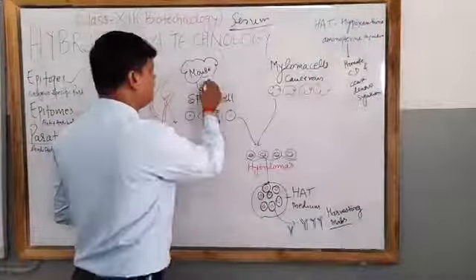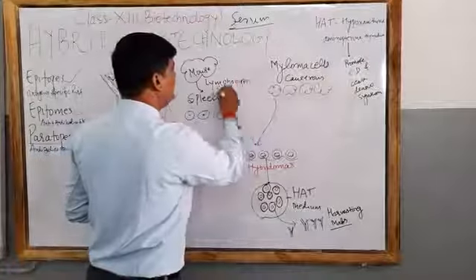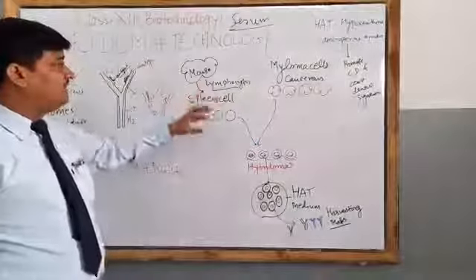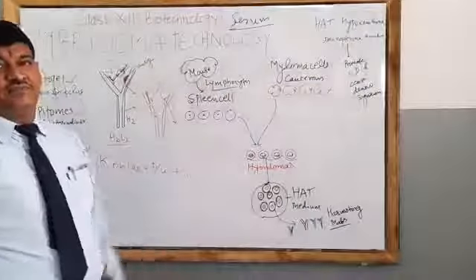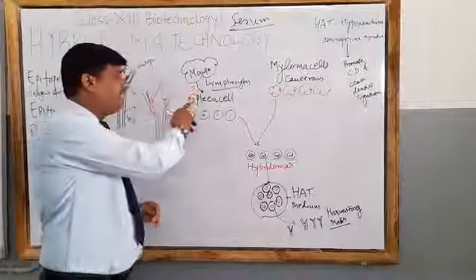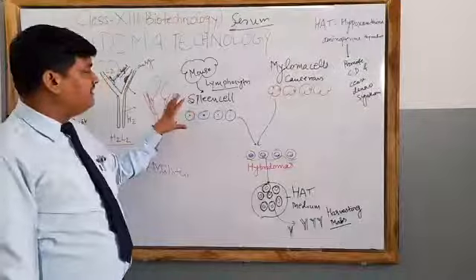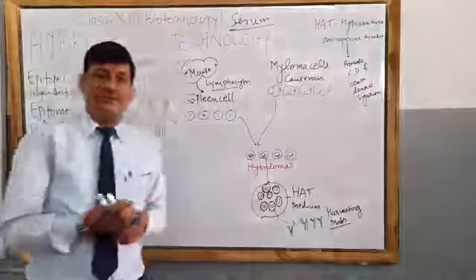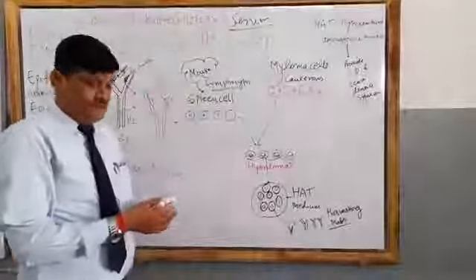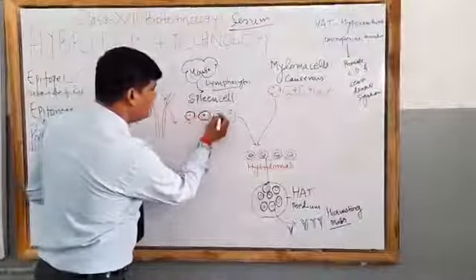And here we are taking the lymphocyte cells. And you know the lymphocyte cells are the producers of B cells. They are the immunity boosters, the immunity-providing substances that we call the antibodies. So we are taking the mouse and the spleen is taken out. Why are we opting for the spleen only? As we know, the spleen is the graveyard of RBCs. So we are taking out the spleen cells.